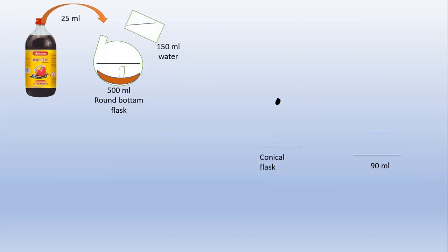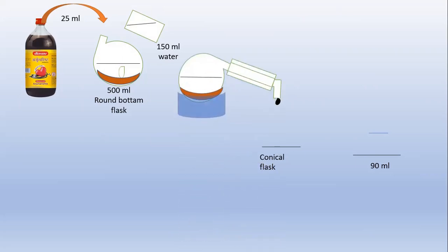To that mixture we are going to add a little quantity of pumice powder. If pumice powder is not available, you can use bumping chips or small porcelain pieces to avoid bumping and to maintain uniformity in temperature.